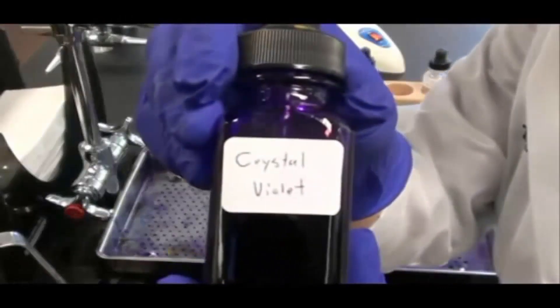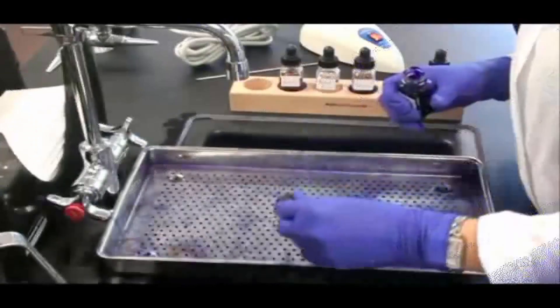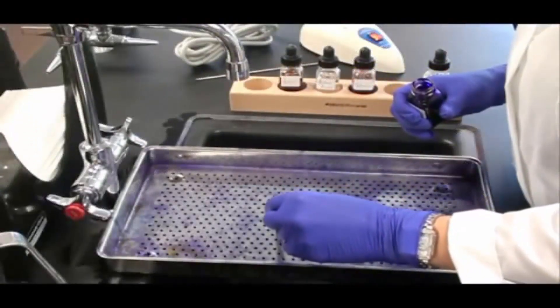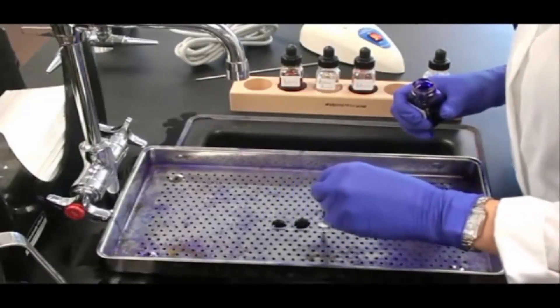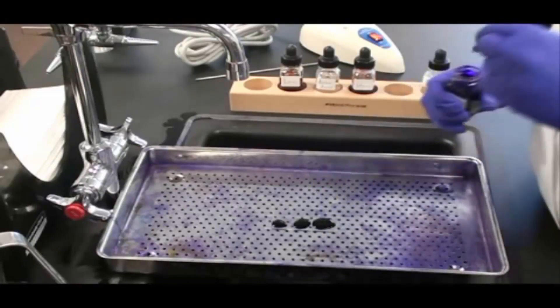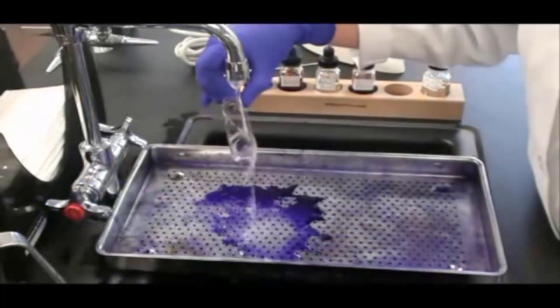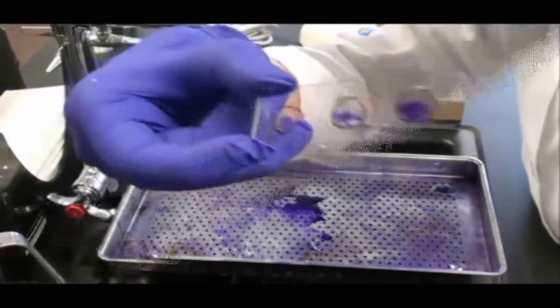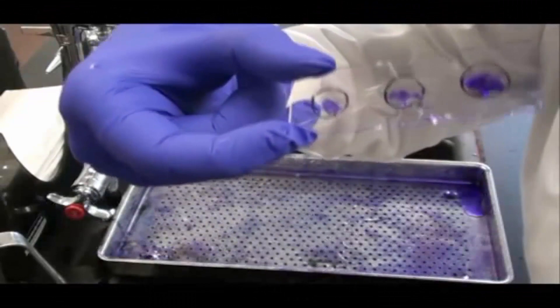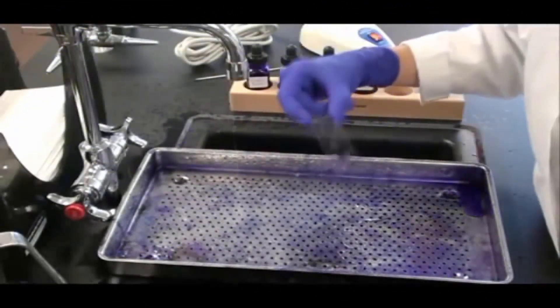My first step is to apply crystal violet. This is my primary stain. I let drops of crystal violet fall onto all three of the smears on my slide. Then I wait for one minute. After one minute I rinse, continuing until the water coming off the slide runs clear. At this point all of my samples are stained purple with the crystal violet.